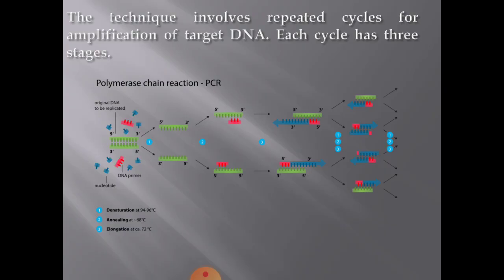So the original DNA strand 5' and 3' and opposite 5' and 3', but the synthesis begins at the 3' hydroxyl end of each primer, both the sides. You can see how exactly the reaction takes place. The primers are extended by joining the bases complementary to DNA strands.